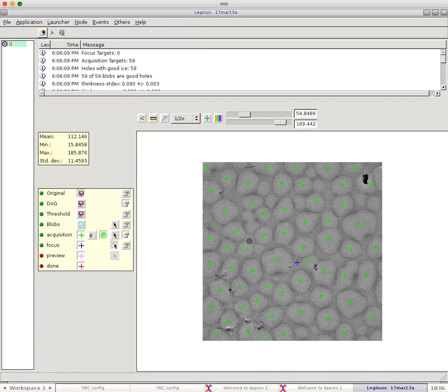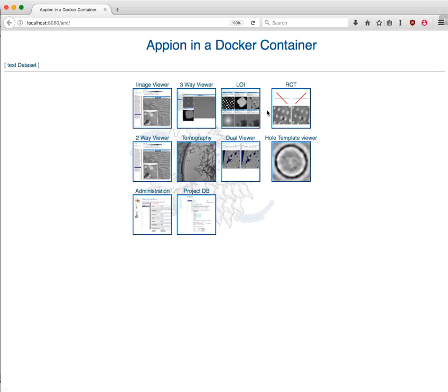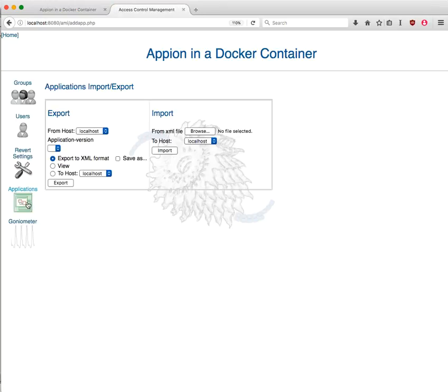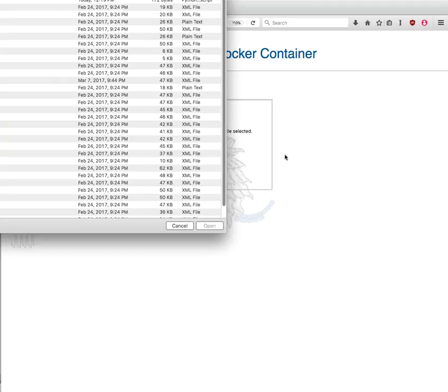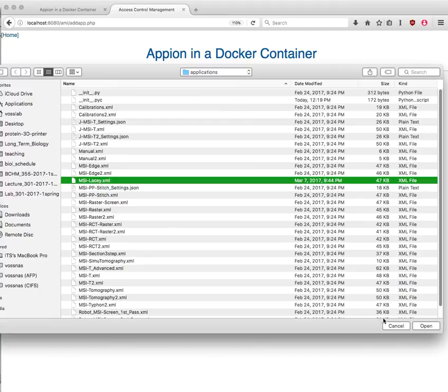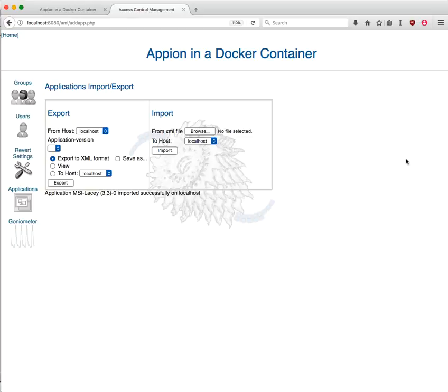One thing you might want to do is see how this fits into the larger Legenon pathway. So I'm going to switch over to my web browser here. Go to Administration, Applications, and I'm going to load the MSI Lacy XML imported. So now we have MSI Lacy in our Legenon, for those people who haven't added it to their Legenon yet.